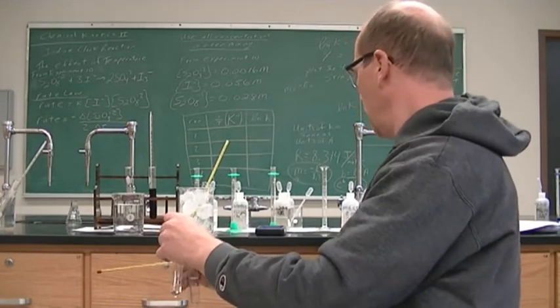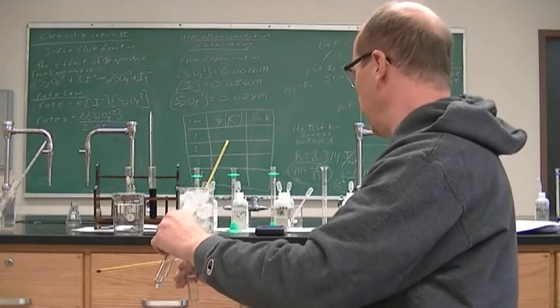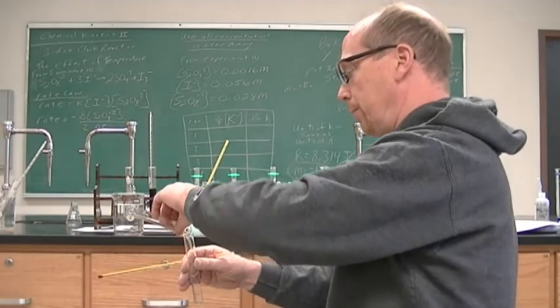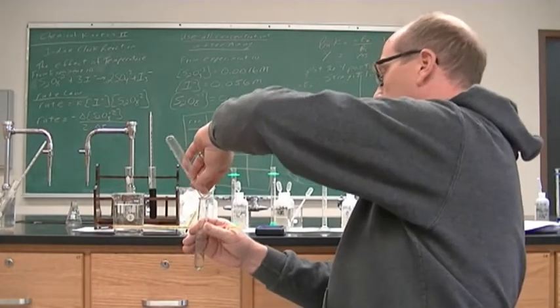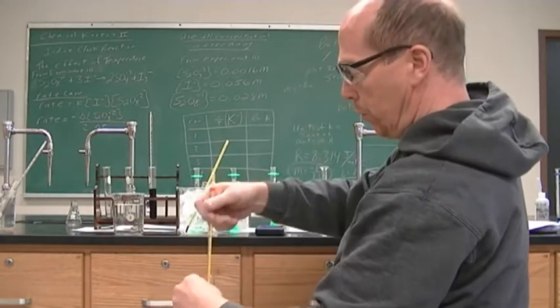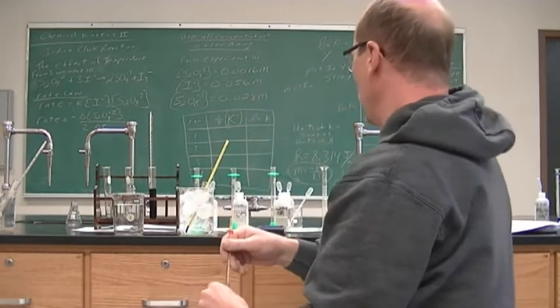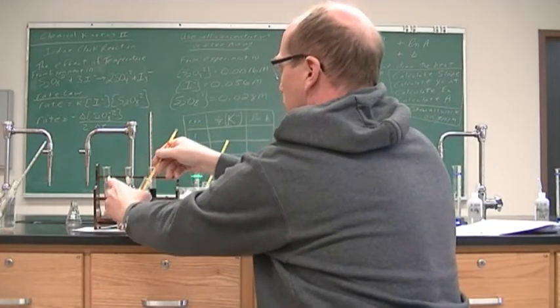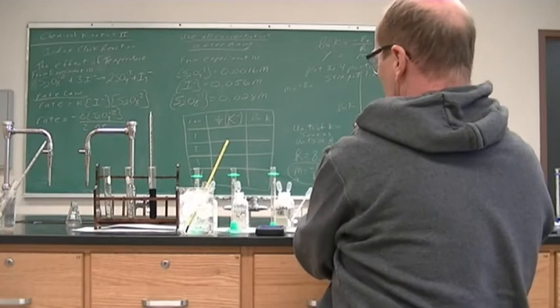All right, so we are up at the 5-minute mark. Right now we are at 5 minutes. So I put that in at the 5-minute mark. And then I'm going to mix this up for an entire minute. Get back in the ice water. We were still at 9.5 degrees Celsius.